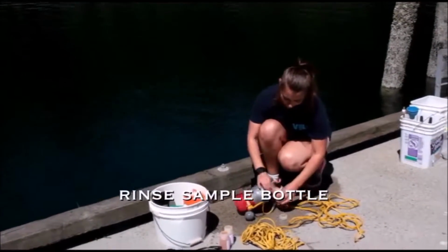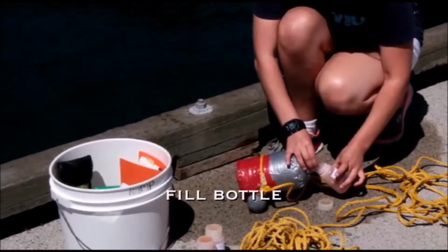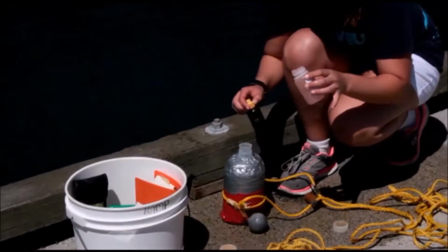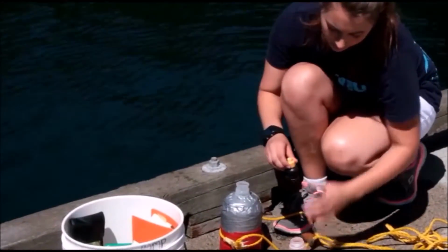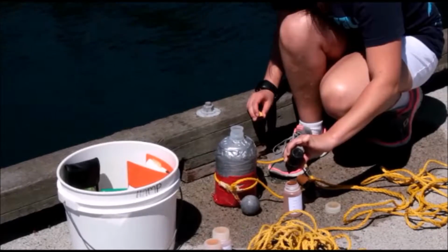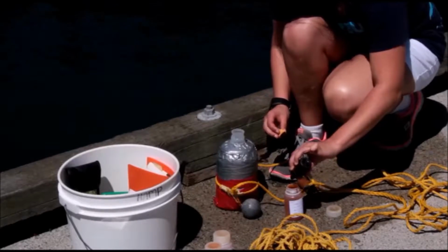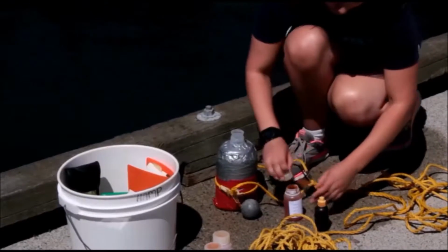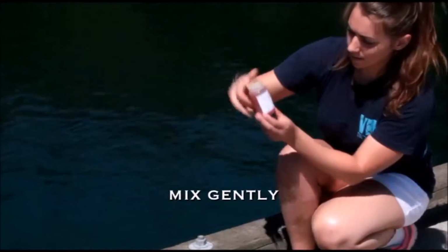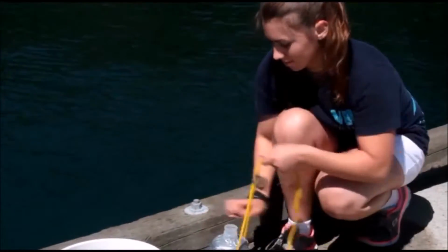Rinse sample bottle. Your sample bottle should be clean, but giving it a rinse is always a good idea. And then fill it right up, leaving just enough room for the Lugol's. Add the Lugol's. 8 to 15 drops is usually about right for one of these 120 ml sample bottles. But it does depend on the strength of your Lugol's. That can vary, and also how much plankton there is in the sample. If there's more plankton, it takes more Lugol's to stain it. Mix it gently by inverting it, check the color, and then you can empty your bottle and move on to the next sampling depth.